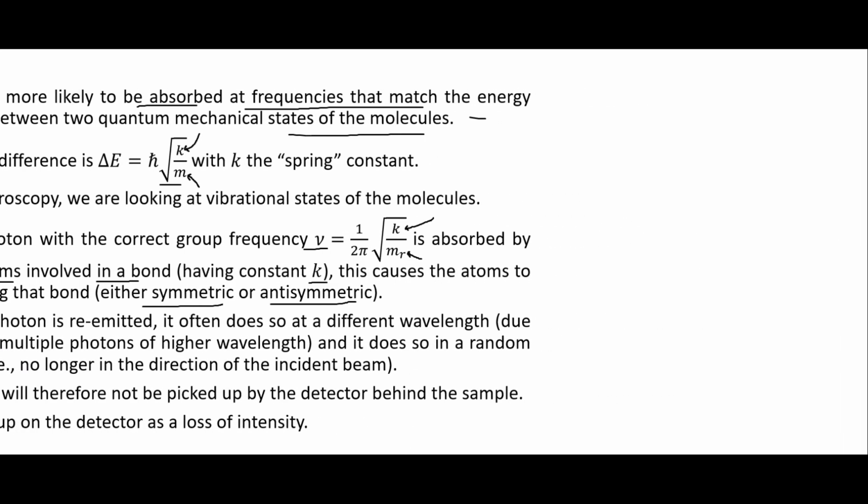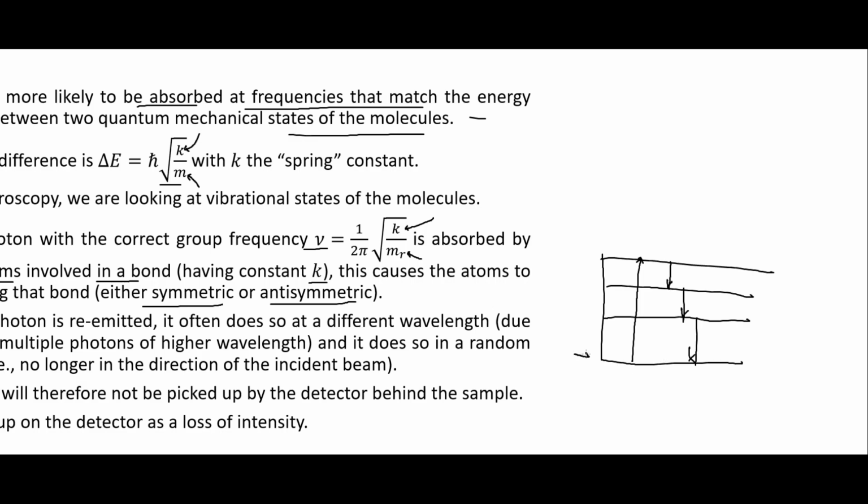So what I'm saying there is essentially, if we have our energy diagram here, we have our ground state and our first two excited states. We might have it go up here and get promoted to the second excited state, and then when it relaxes, instead of going all the way down, it goes down by 2 or 3, I guess, as I put this as the ground state.